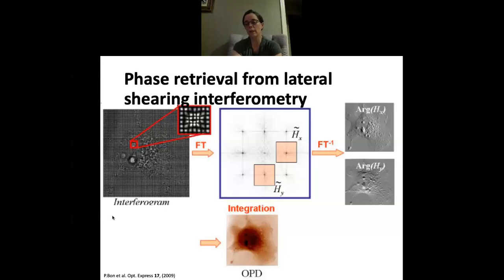The phase gradient is the derivative of the function that represents the phase delay, and this step produces a set of intermediate images that appear very similar to DIC images. Not surprisingly, because DIC is also a lateral shearing interferometry method, but if we called it that, we would have to call it uniwave because it occurs only along a single direction.